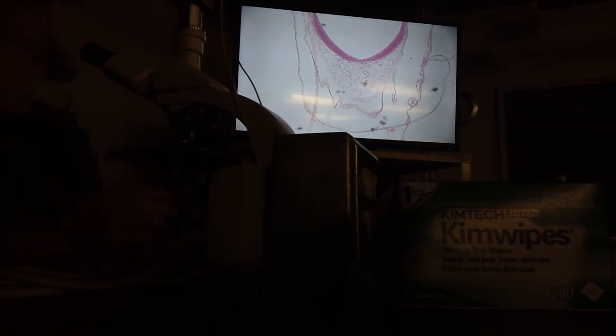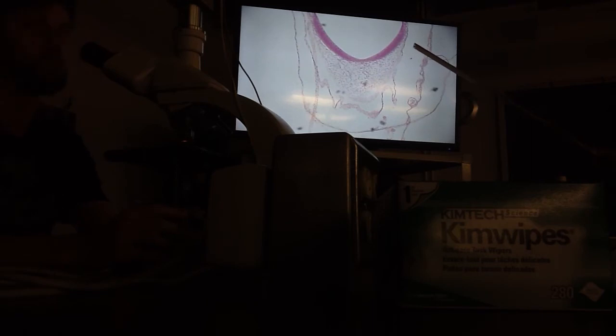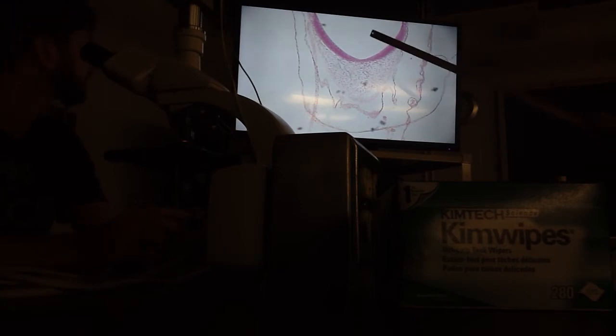This isn't the best specimen, but that's how you make the determination. So if yolk sac is on this side, is this right or left? The embryo lies on its left side toward the yolk. This is the left side of the embryo, you should know that. Okay? Got it in your mind? Left side of embryo. So this is the right side of the embryo over here.